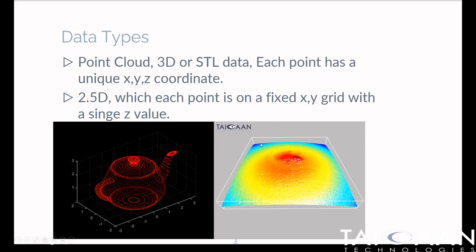So we have two data formats here: a 2.5D data format shown on the right, and this point cloud or 3D or STL data shown on the left.